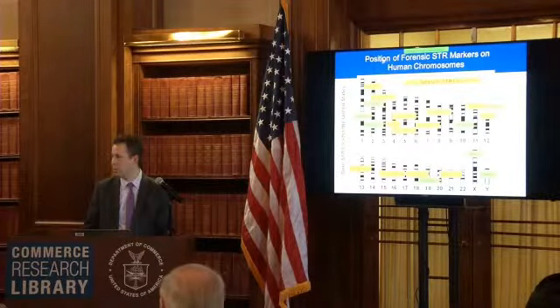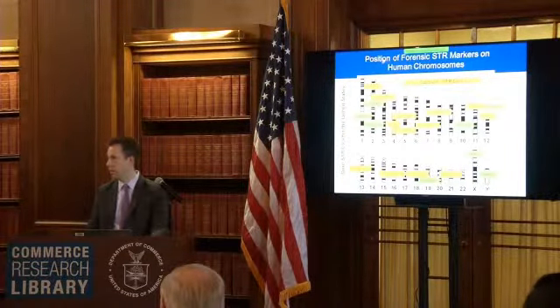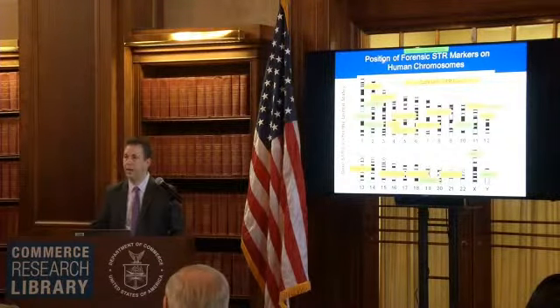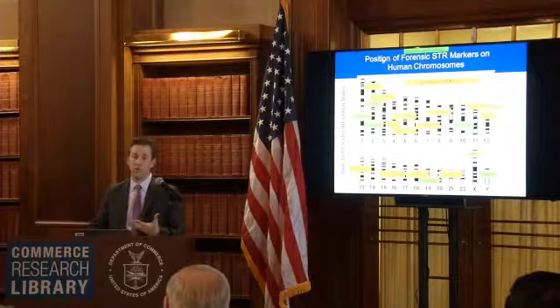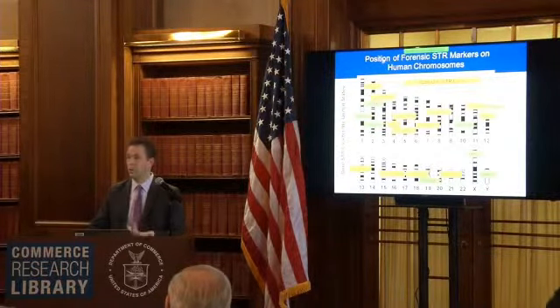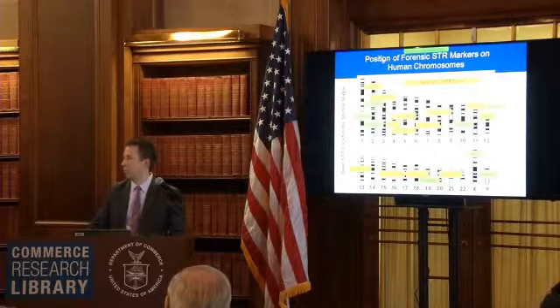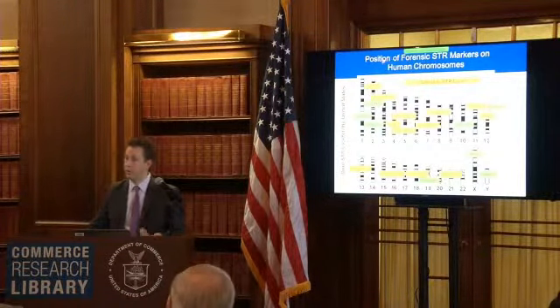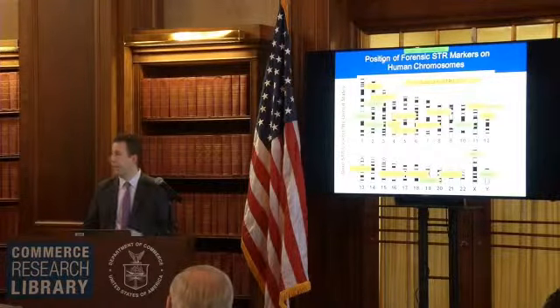Hey, Pete, what happens if all the markers are not available in a given sample? If you get a partial profile, let's say you're attempting 13 and you only got 6 to work, you would have a lower match probability, so it might be 1 in 1,000 or 1 in 10,000. And in that sense, you would be limited in that sample.